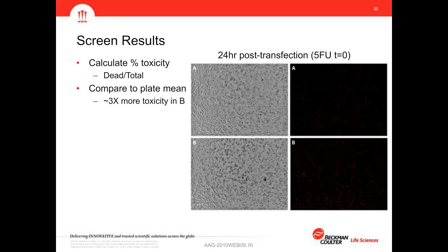Shown here is just 2 wells from a plate that was 24 hours after transfection. So again, in this case, it would be prior to 5-fluorouracil or simultaneous with 5-fluorouracil addition.